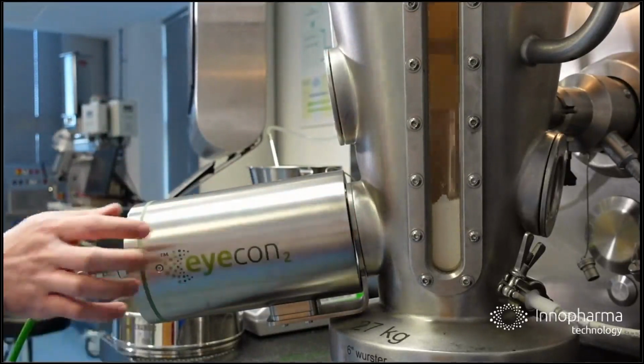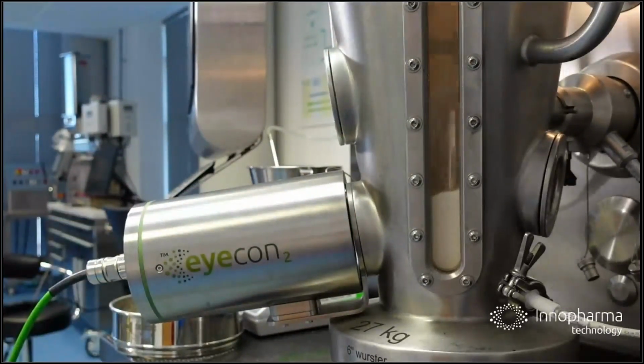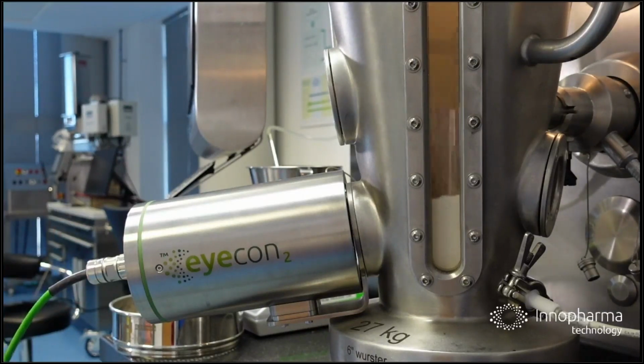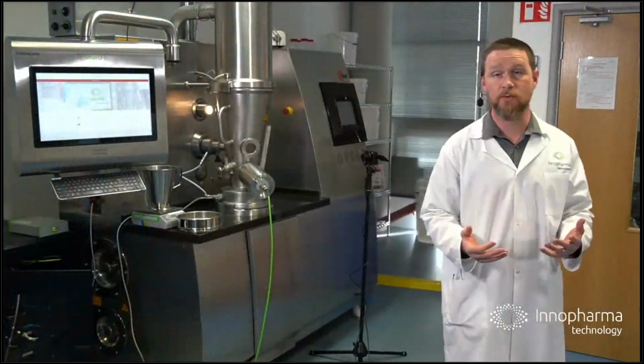There's a gap here, and you might be able to see the flash of the LEDs as well, just taking images every couple of seconds of the particles inside the process. You can see from the long operator window that the material's fluidized, so it's constantly passing by the window. So we're getting data every couple of seconds on what's happening here. If we change something like airflow, liquid addition rate, air temperature, we could measure that in real time. At the back here, we can see the green communication cable, and that will run over to your process area where you'll have maybe an industrial PC or something like a laptop to read that.